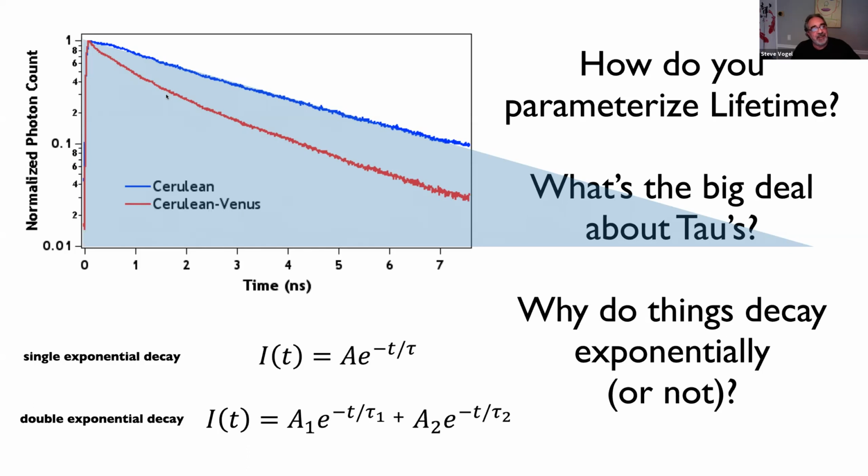If that probability does not change with time, if it is constant, right? So in other words, at time equals 1 here, it might fail. It's a probability, right? So let's say it has a 50% chance of going down. We're saying if it didn't fail at 1, at time 2, it's going to have that same 50% probability. At time 3, it's going to have that same 50% probability. If a system behaves that way, it decays with a single exponential. If that probability changes with time, it will not.